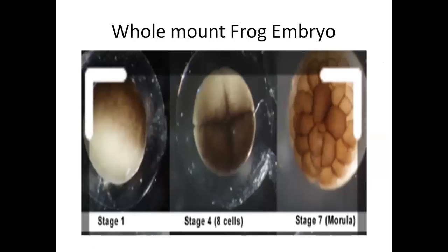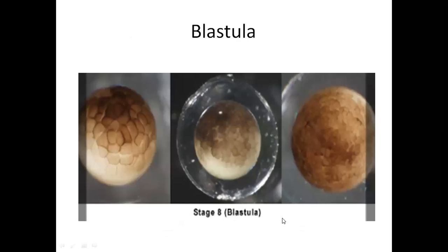These are the whole mounts of frog embryo. Maine abhi aapko cleavage, blastula, gastrula, neurula ke sections dikhaaye, ab main aapko dikha rahi hoon whole mount - poora. You can see that this is egg, cleavage start hua, four cell stage, aur jada hua toh yeh morula ban gaya hai - dikh raha hai aapko. Blastula ke andar agar hum whole mount ko dekhenge - yeh morula hai. This is eight cell stage blastula.